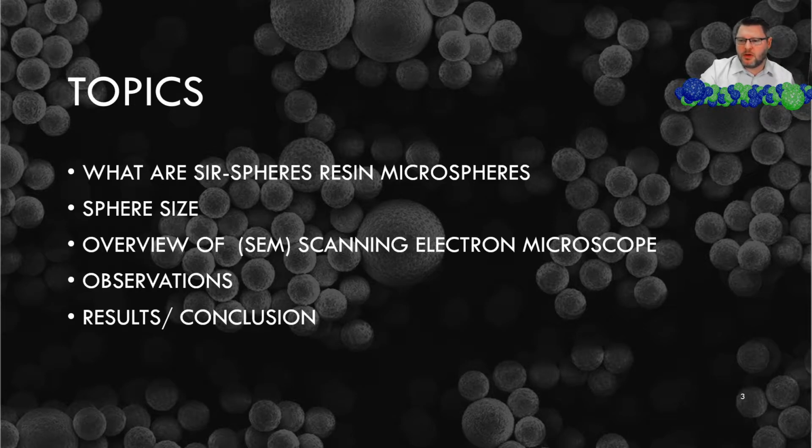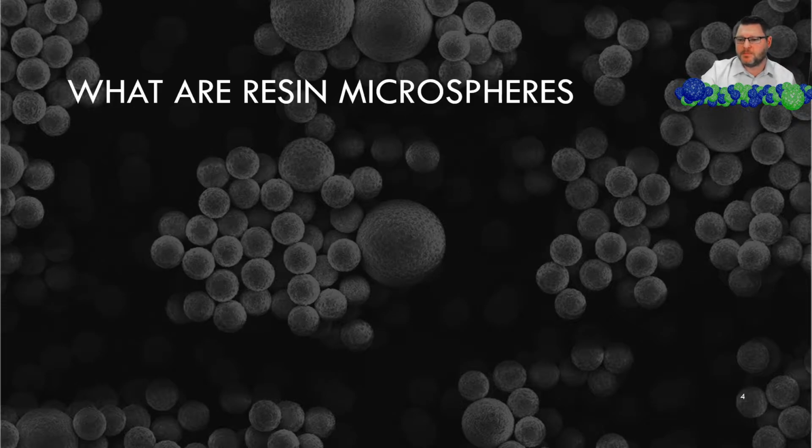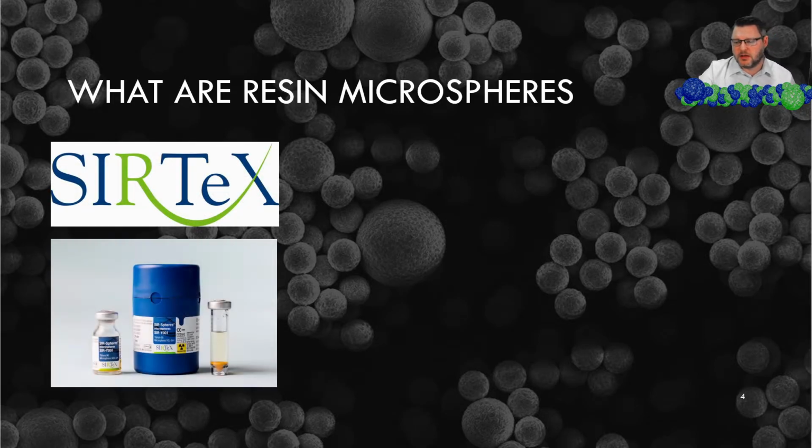Topics today: what are Sirsphere resin microspheres? Sphere size, overview of SEM, observations, results, and conclusion. Here we go. First, what are resin microspheres? We used Sirtex resin microspheres. This is Y-90 impregnated resin spheres.